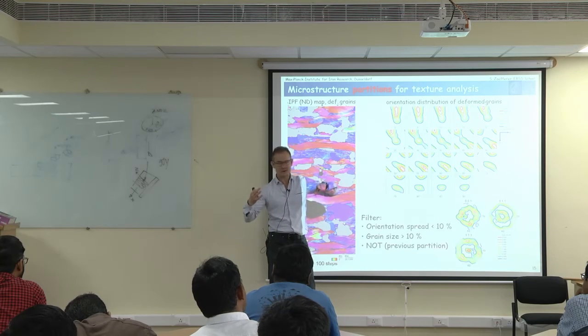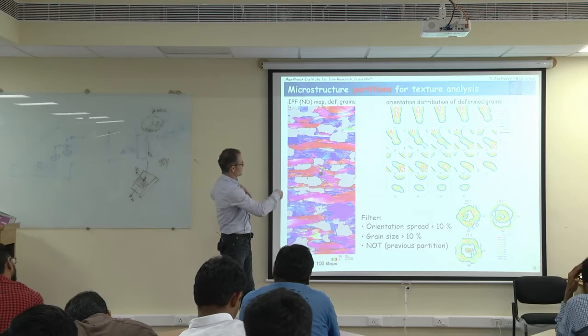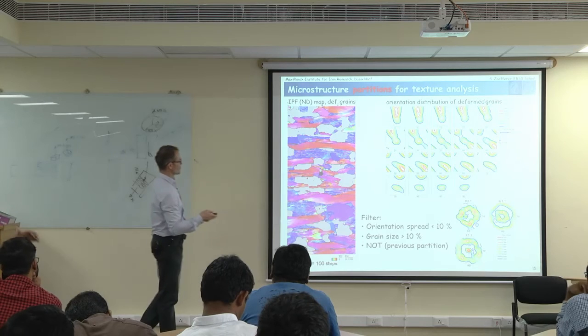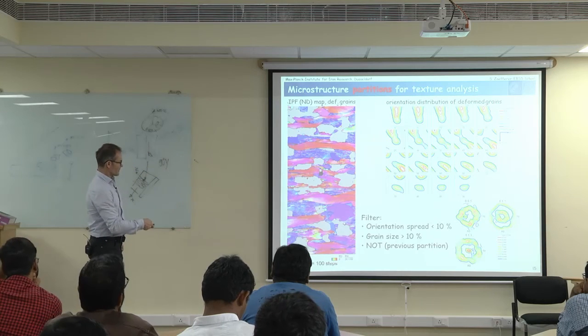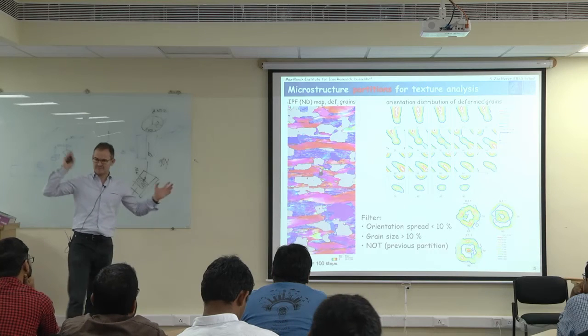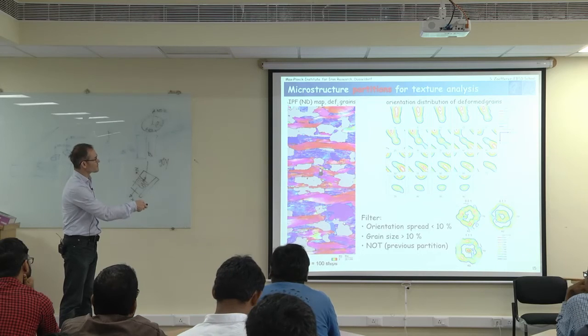In the deformed structure we have both. And indeed we have the blue ones deformed and the red ones deformed. The blue ones make this fiber here, and I really need to come back to the computer to show you this, and the red ones make this fiber here. And you may ask, how do I know that the red ones belong to this one?